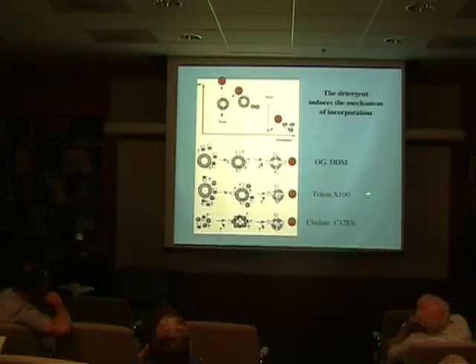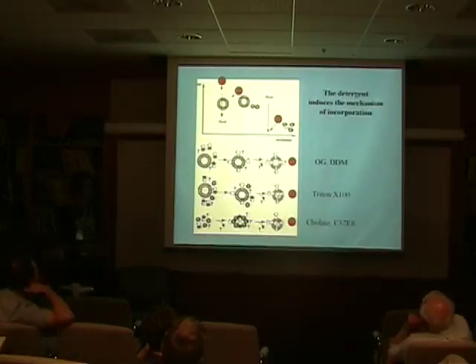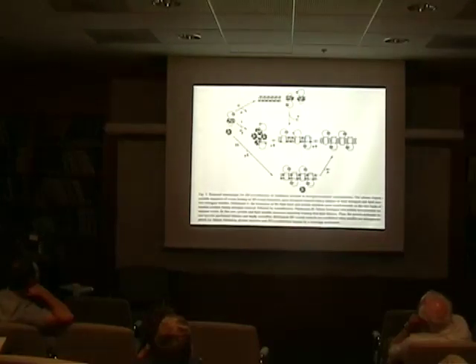And in between, there is one mediated by Triton X-100, in which you have a transfer from the lipid-protein-detergent mixture to the liposomes. So that's what we know about proteoliposomes at high lipid-to-protein ratio. If we try to expand this to 2D crystals, just by looking at the different results of crystallization, there are also possibly three mechanisms of crystallization.